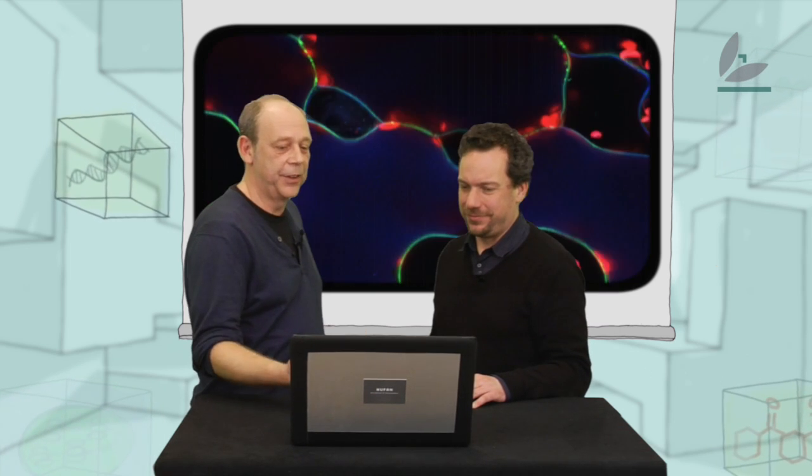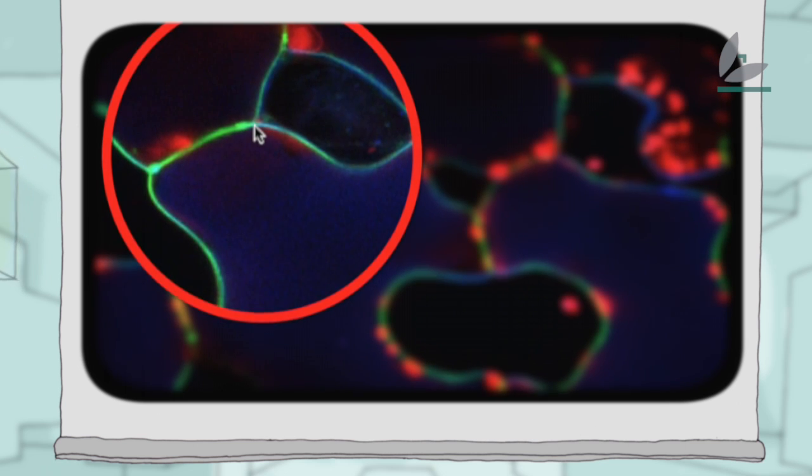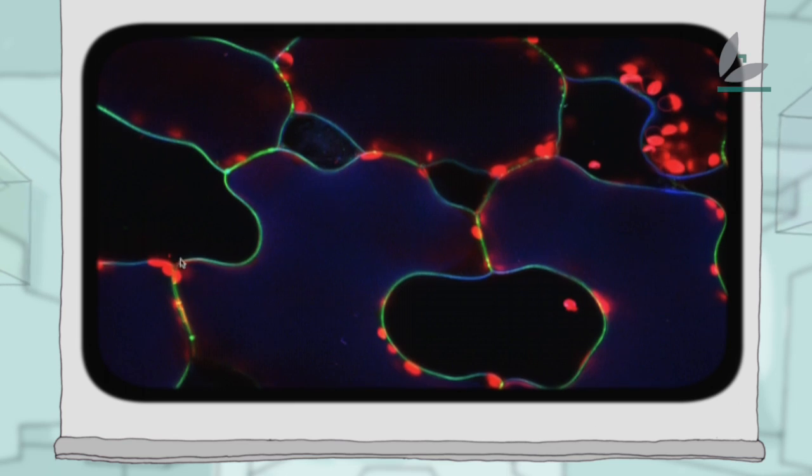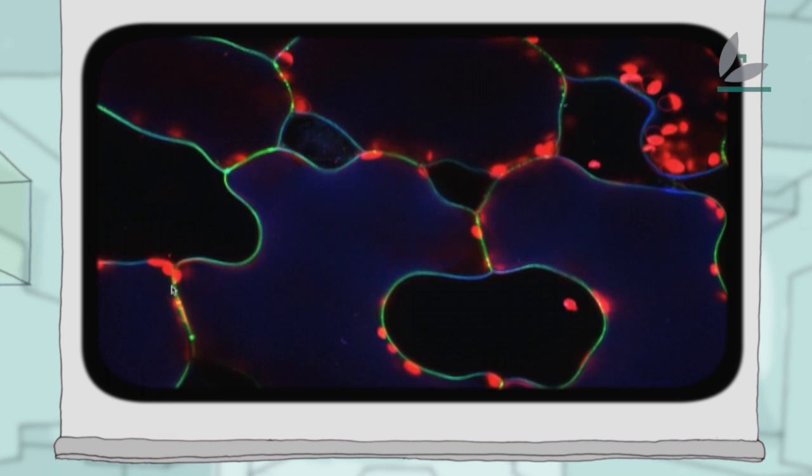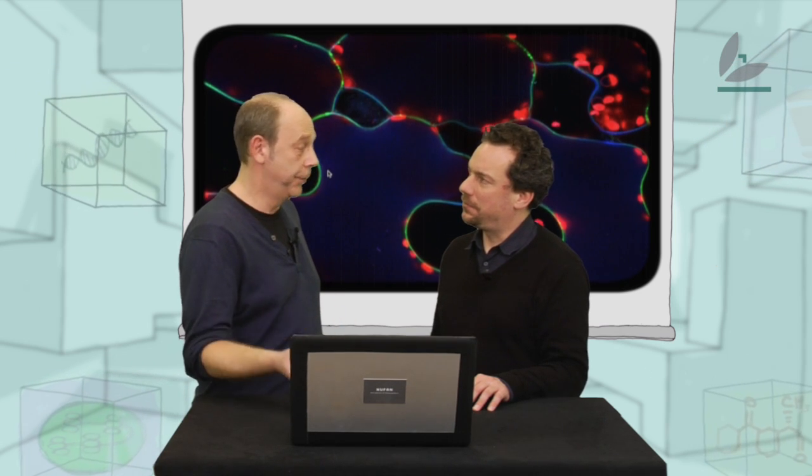And the next picture? So in the next picture, you see this fine greenish lines, which are detected by another protein which we are working in the lab. Okay. So it's, again, the protein which you are interested in, which is linked to a fluorescent dye, again, the green color. Yes. It's linked to a green color. And we were interested to localize it within the cell and to know if it's actually accumulating at small pores, which allow the communication of signals between cells, which are attached to each other. And these are the fine dots you see there. Okay. So that's how you found out that this protein is also in these pores. Yes. And this helped us to understand how this protein works and that it's actually associated to these pores. And we use this now to interfere with the cell communication between cells.